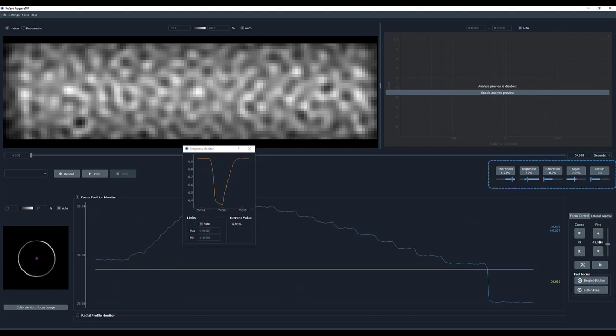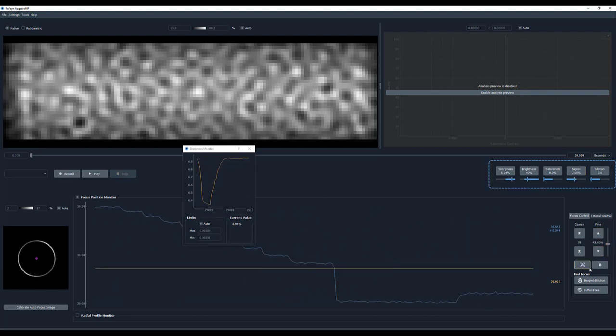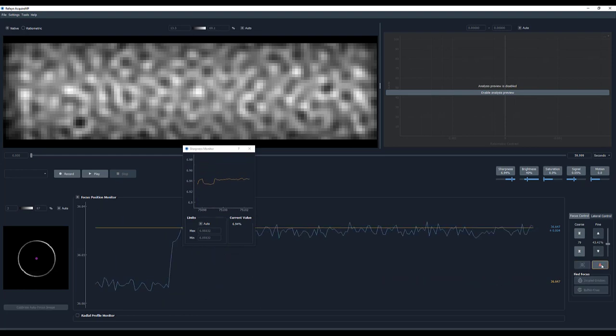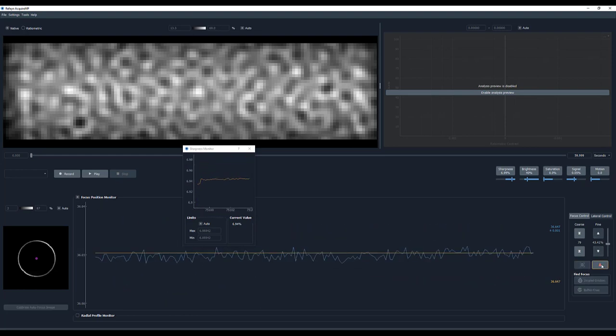When you reach the position of maximum sharpness, press the Set Focus button followed by the Lock Focus button.